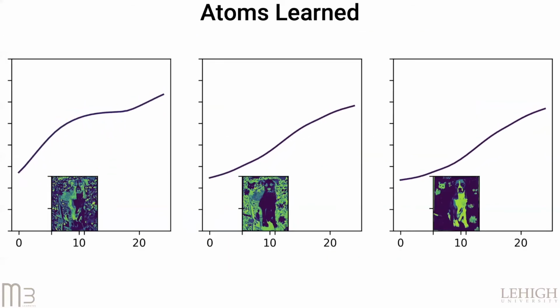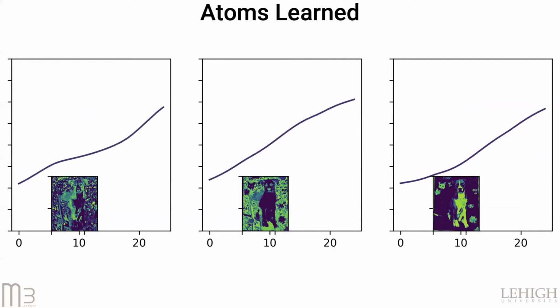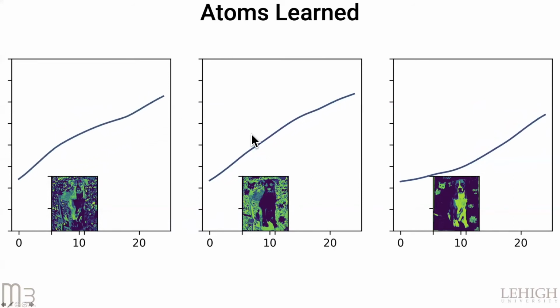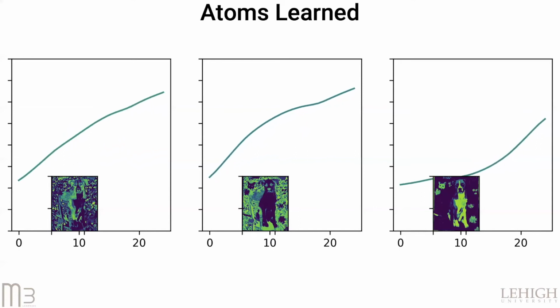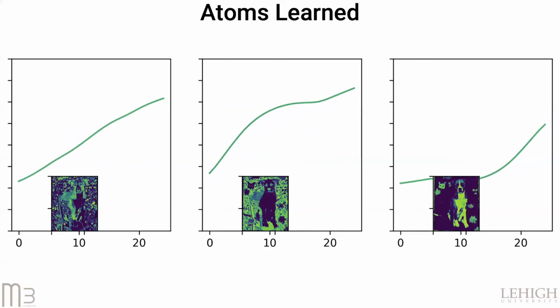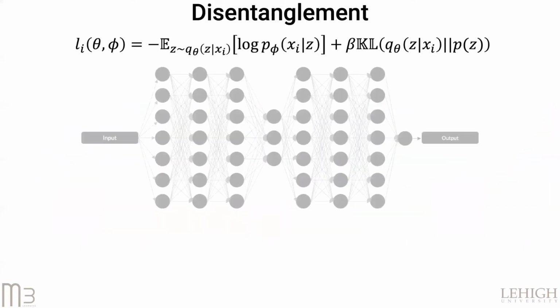If we slowly increase the value of alpha, we can generate what the spectra look like. And with the dictionary learning, what you see is that the curves are essentially devoid of any of the important curves and features that were in the original spectra. This is because the mean squared error in the dictionary learning doesn't care about the subtle features of the spectra. It only cares about having close to the mean squared error or the average response. So if we then were to try to interpret these spectra, they wouldn't be that informative in terms of guiding our physics. Now let's compare what happens with the deep autoencoder.